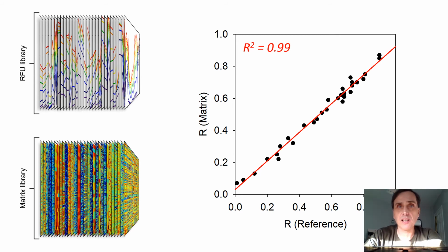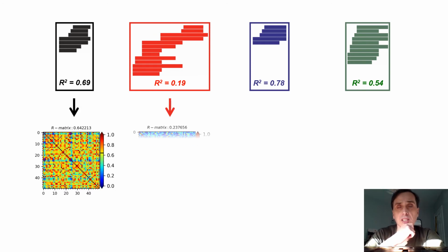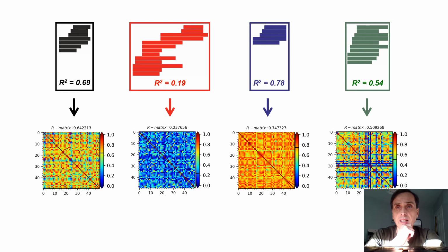And so this is a general method that we think should be followed for any optimization with HDXmodeller: to separate data into different subsections, analyze them independently, and then use the R matrix values to help you ascribe confidence to the optimization outputs for each subsection.